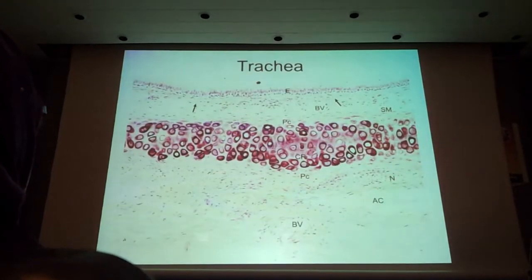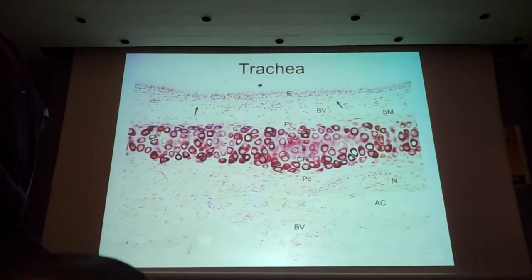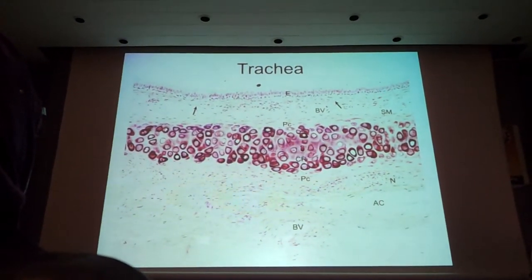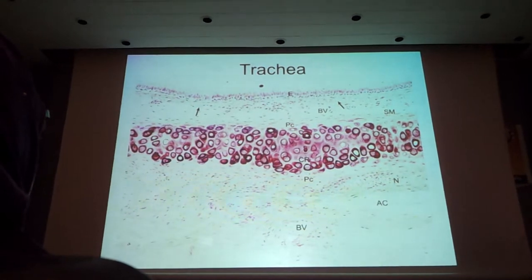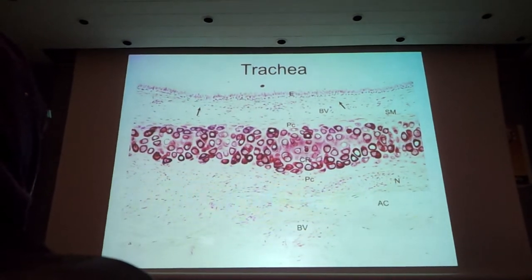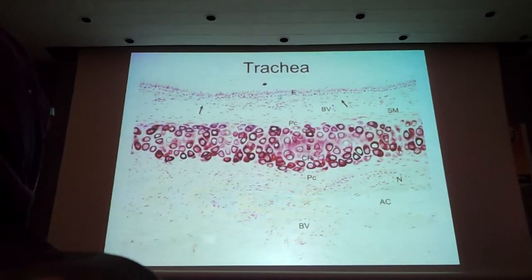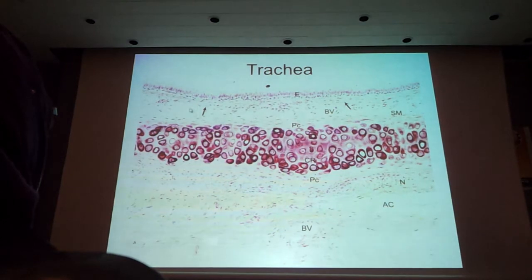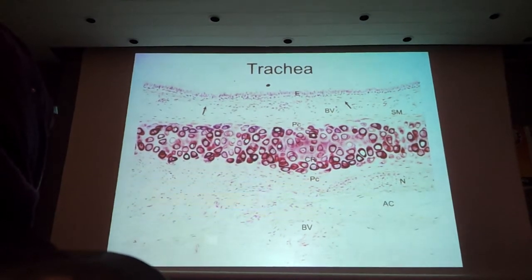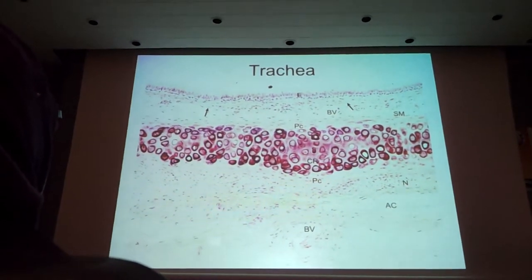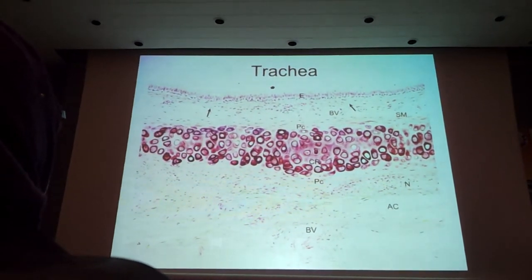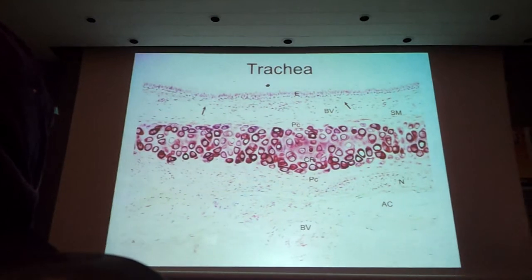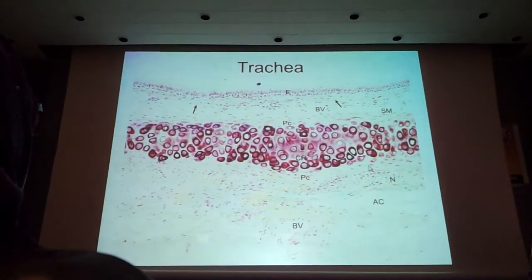Here is another view. Again, you have the mucosa with the respiratory — pulmonary epithelium — and lamina propria. Then you have the sub-mucosa. And then this is the cartilage with its perichondrium.